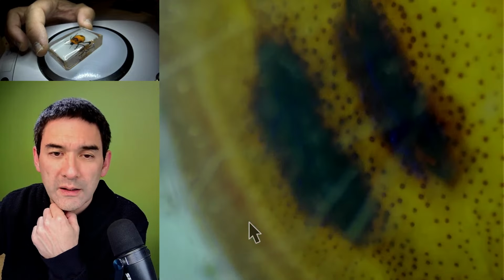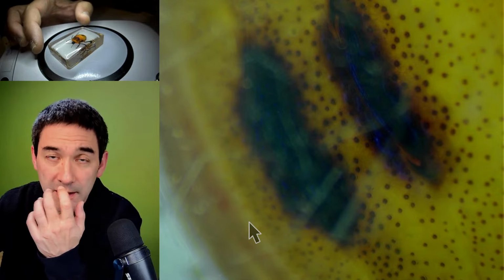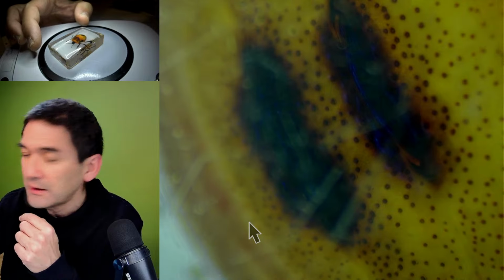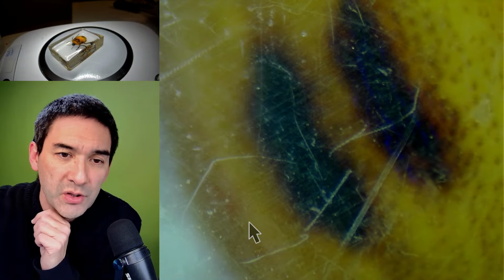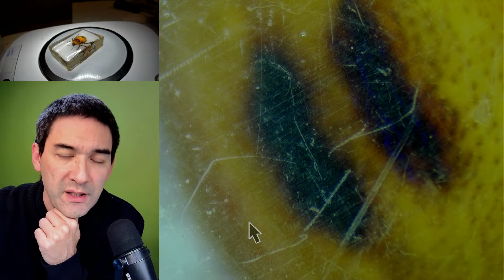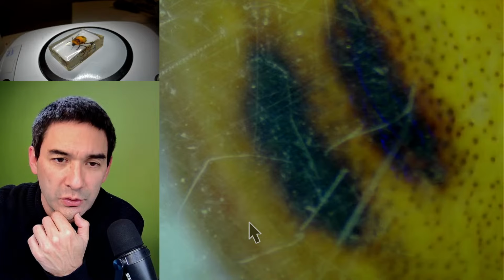But normally, polarizing filters work if there is some kind of reflective light. But over here, I think the reason why the image quality is not so good is because of those scratches which directly reflect the light, and I think that's a little bit more difficult to remove.